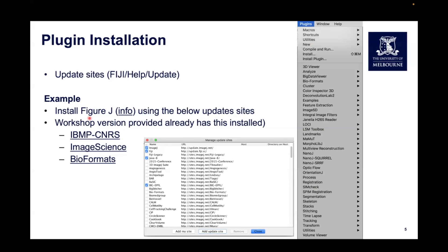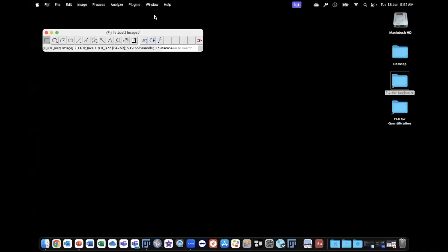You won't need to do this as this is pre-installed in the version of Fiji that we've provided. However, if you wanted to install this, you would need to add these three sites into your Manage Updates within Fiji. I'll show you how to do that.